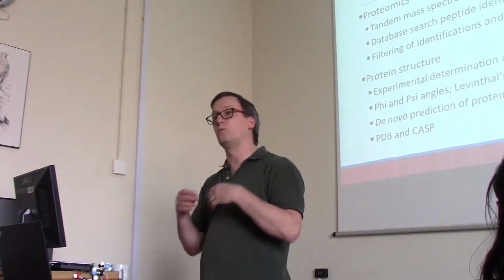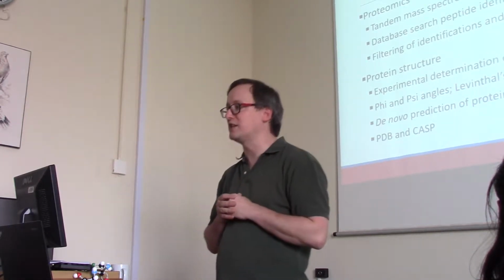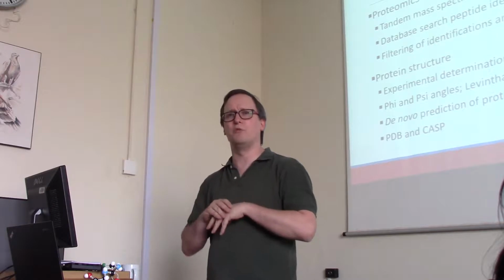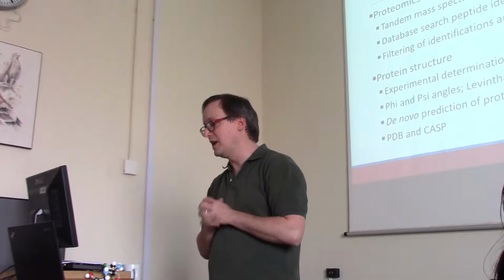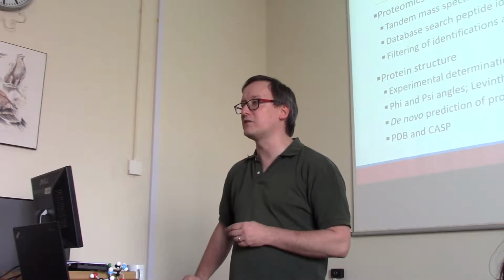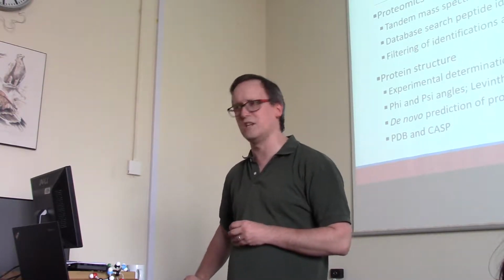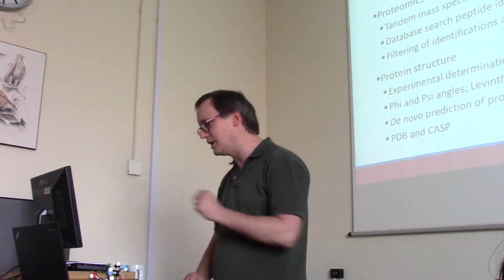So we will spend a little time on how this technology works, move then into sort of the canonical bioinformatics pipeline for making sense of these data, which is the database search algorithm. At last, we'll talk a little bit about how we figure out whether those algorithms worked or not, and how we build back a protein list from those peptides. And with that, we will move into the fine world of protein structure. Now, protein structure is a part of this lecture that I decided to rebuild pretty heavily. Last year, I realized I'd turned it into sort of a bullet list of terms, and it was just not doing anybody any good. But this year, we have a good solid set of material that I think everyone can get their heads wrapped around.